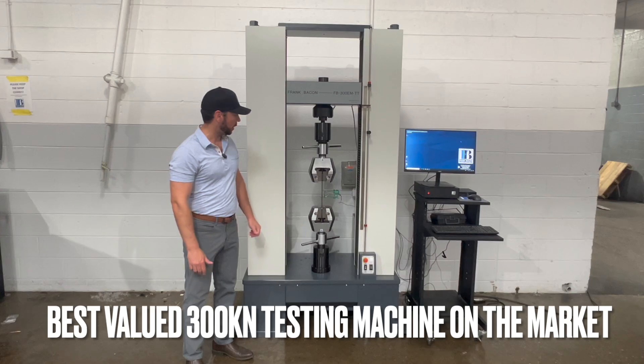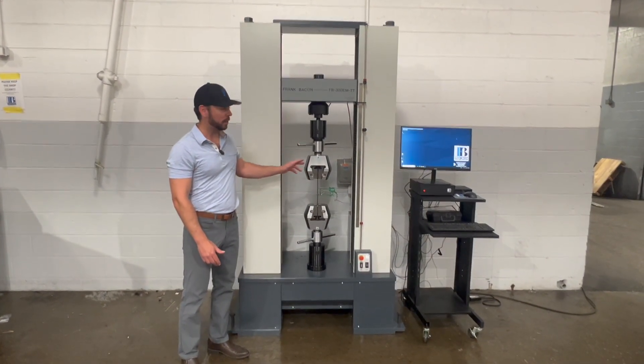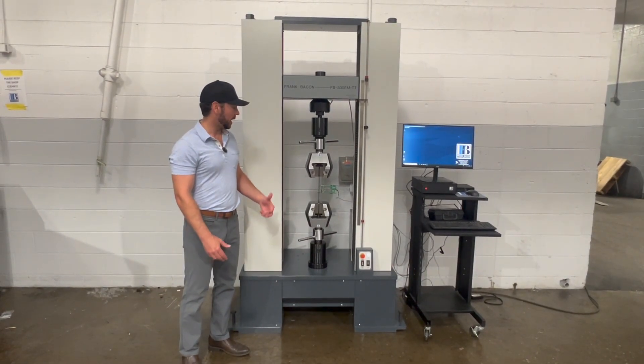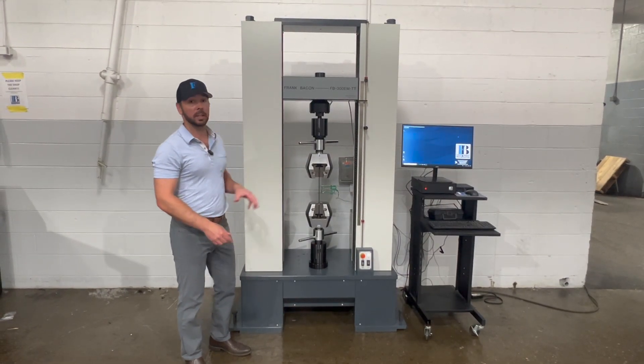We've got it equipped with our 300 kilonewton Frank Bacon wedge grips, so you can do anything from flat to round specimens in a variety of different sizes and thicknesses. I'm going to get you over to Chuck and he's going to show you how easy it is to run a test on a Frank Bacon machine.